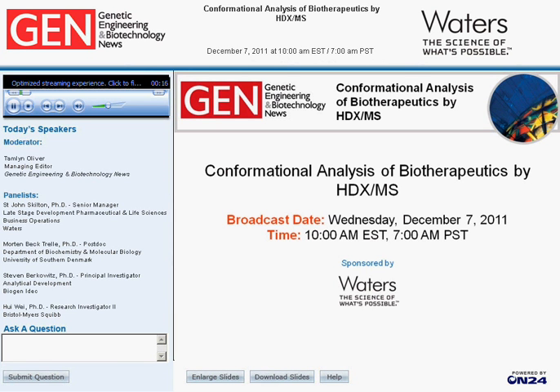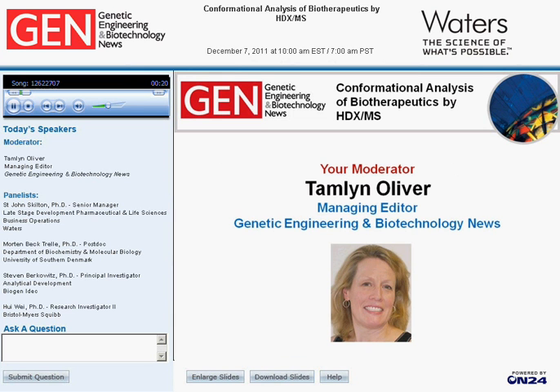Hydrogen-deuterium exchange combined with mass spec is a powerful combination of technologies for the analysis of biotherapeutic protein conformation and examination of higher-order structural dynamics and epitope mapping. Advances in HDX-MS hardware and software not only offer scientists the ability to monitor changes in the higher-order structure of a therapeutic protein, but also to examine protein dynamics and association with other proteins and biomolecules. It's no surprise that its use is increasing rapidly.